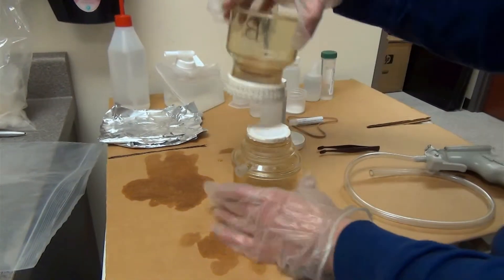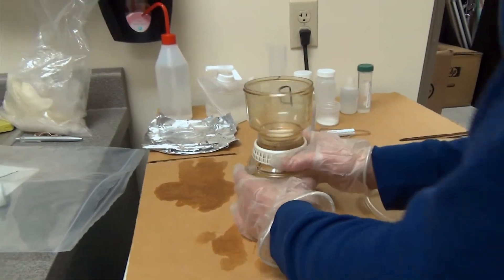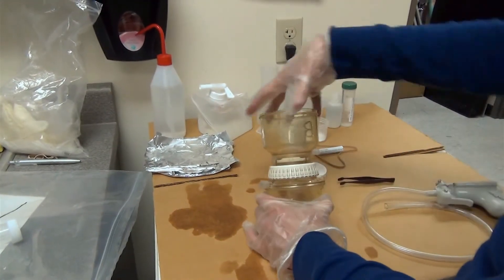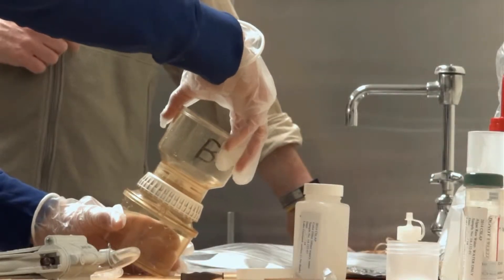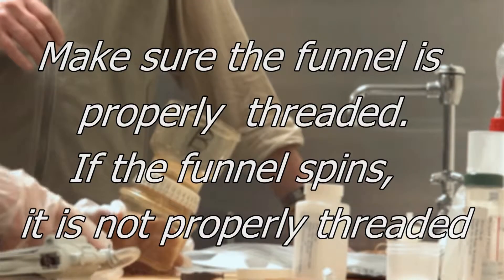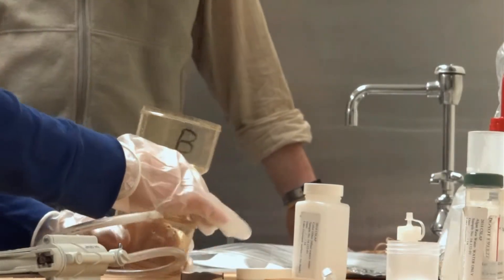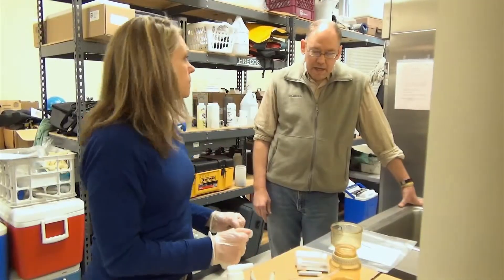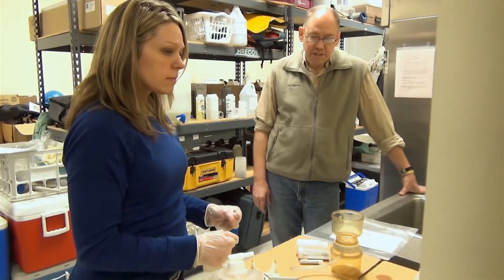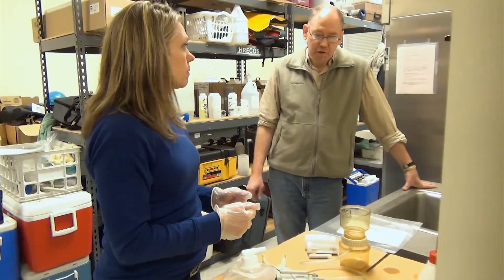Take the funnel and place it on top. Close it by holding the bottom and spinning the top to tighten. If you can still spin it, tighten it a little more. Then reattach the hose. The next step will be processing for both the color sample and the harmful algal bloom, or HAB, filter.